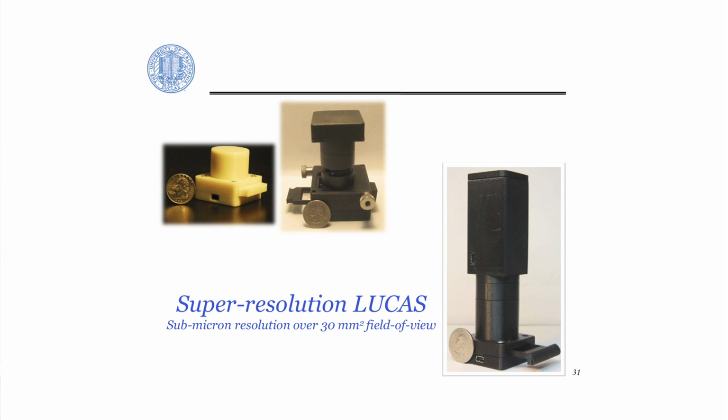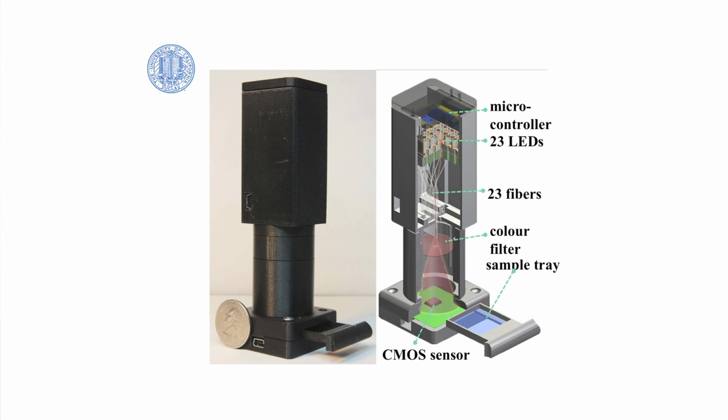So from a design that uses a single light-emitting diode at the top, where you load your sample from the side here, and this is the USB port, now we've complicated the design as shown here, a taller design, but still very lightweight. Less than 120 grams in total. So if you look inside, what you see in this design is a bunch of light-emitting diodes. Instead of a single one, now we use some 20 of these light-emitting diodes. Each light-emitting diode is a very inexpensive commodity. It's on the order of a few cents, even if you buy it in low quantities, a few tens of cents.